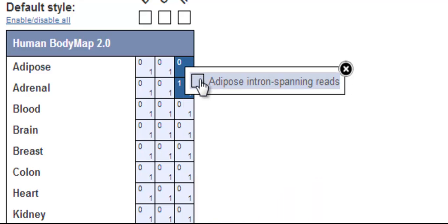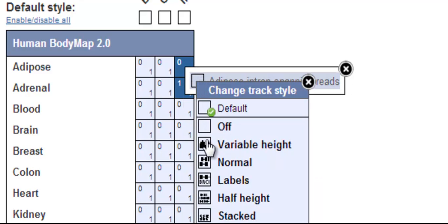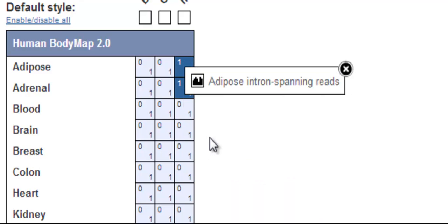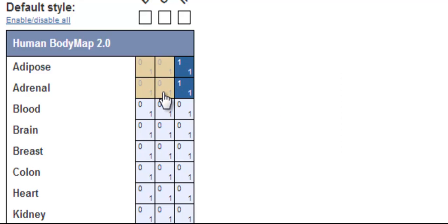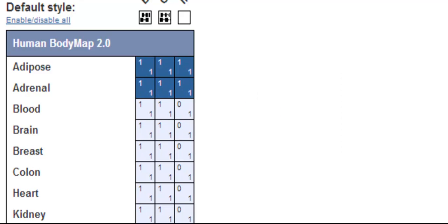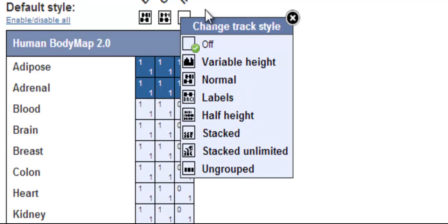To turn on one cell, just click on it. I will select intron spanning reads from adrenal and adipose tissues, with a variable height display. I can do this one by one, or I can click and drag with my mouse to turn on several cells all at once.